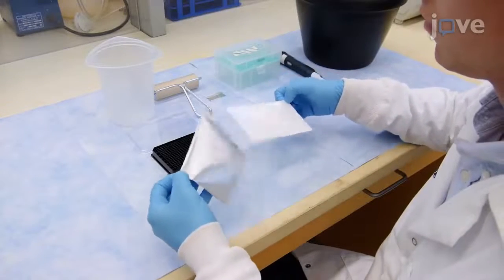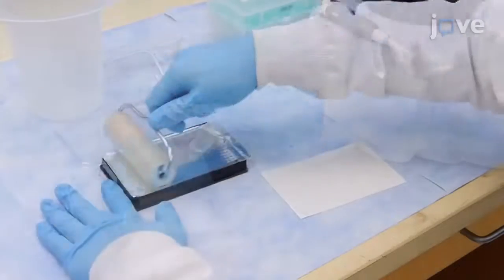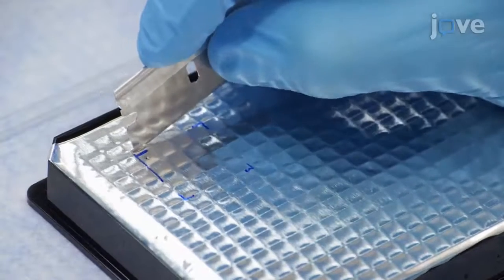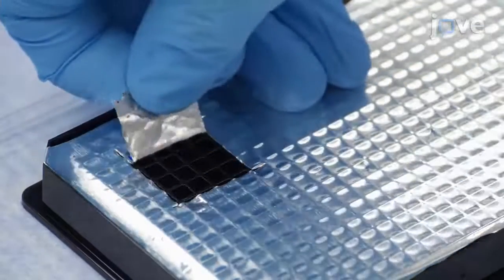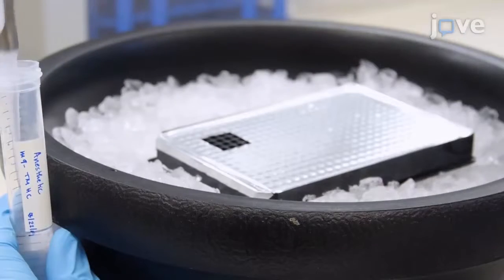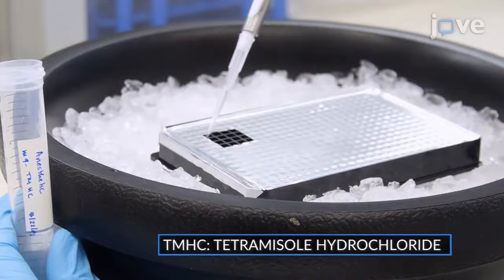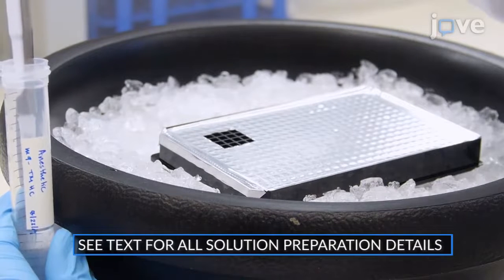Begin by sealing a glass-bottom 384-well plate with PCR adhesive foil to mask unused wells. Use a razor or scalpel to cut away the foil to expose a subset of the wells for use. Add 70 microliters of freshly prepared TMHC into each well and keep the plate on ice. Exclude the outer two rows of the plate to prevent edge effects.